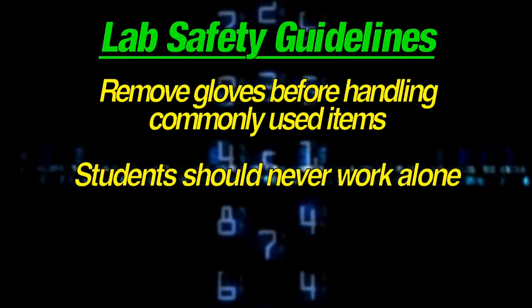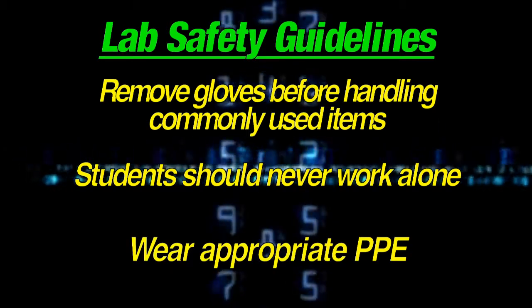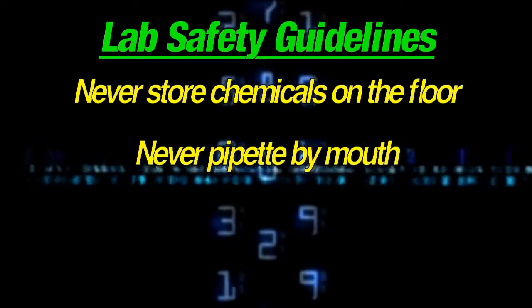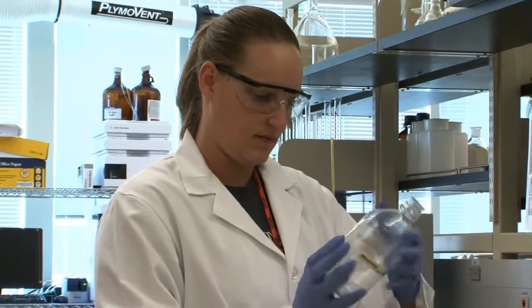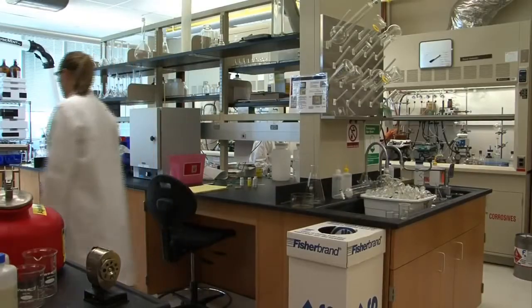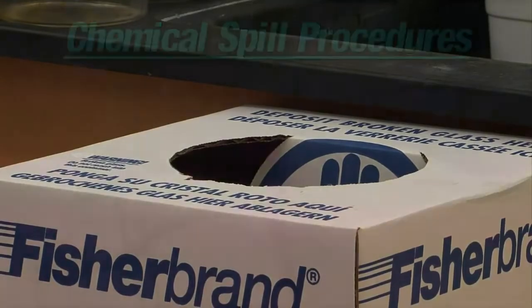Students should never work alone. Wear appropriate PPE. Never store hazardous chemicals on the floor. Never pipette by mouth. Always use appropriate caution and procedures while working with and around gas cylinders. Before working with glassware, inspect for cracks, chips, or fractures. If the glassware is broken, let your instructor know and dispose of it properly in the marked broken glass containers.